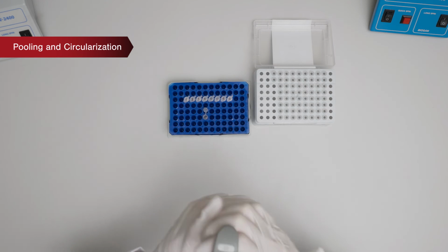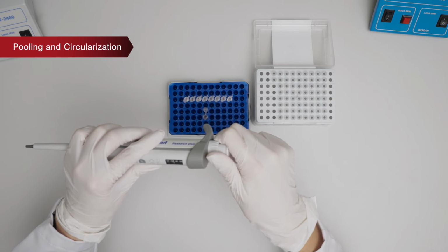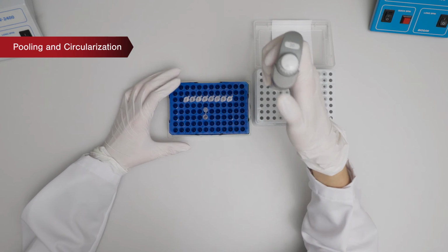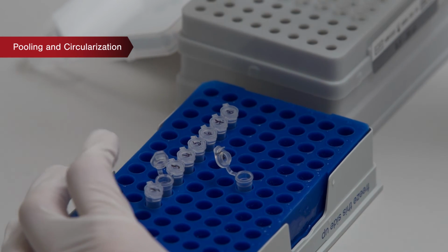This calculation will be suitable for cases where you expect an equal amount of data to be generated for each sample. If the total volume of the pooled samples is less than 48 microliters, then TE buffer is added to reach this volume. But note, if it exceeds 48 microliters, the pool should be concentrated to reach the right volume.